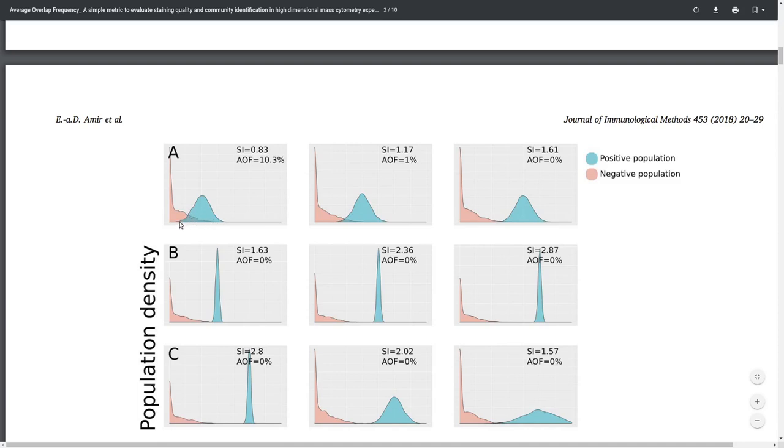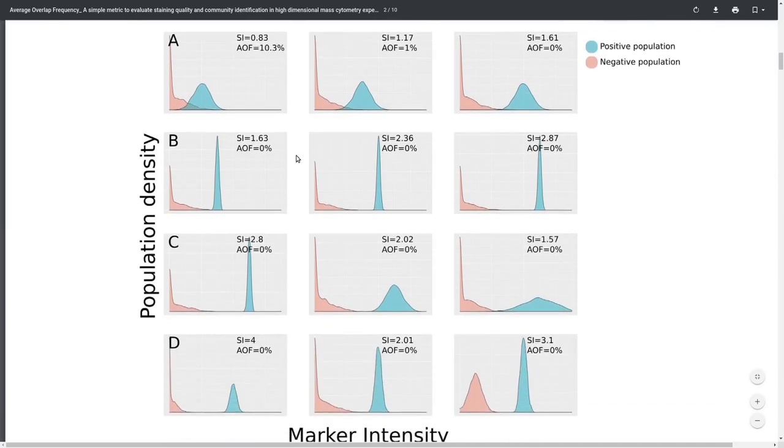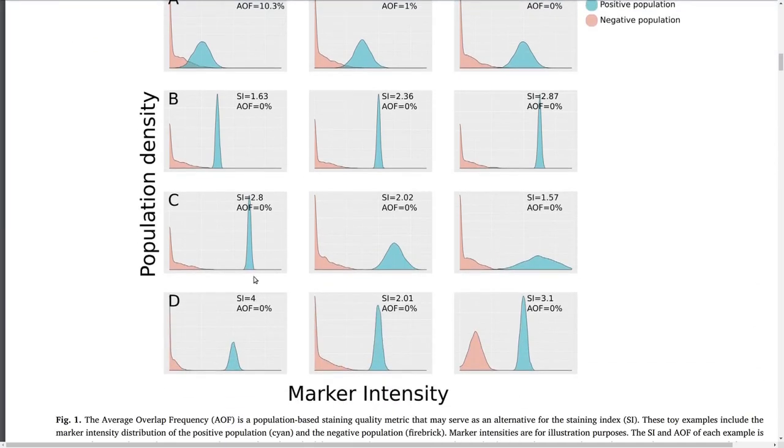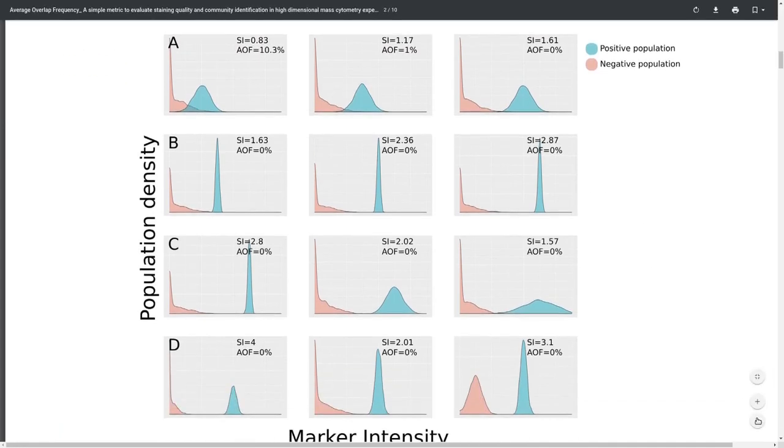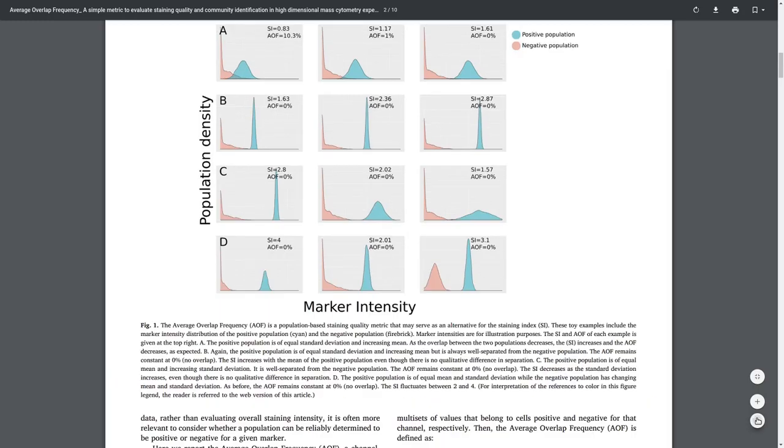The greater the shaded area, the higher the AOF. So an AOF of 0, as in these examples, shows a perfect separation between the positive and the negative peak, while as the AOF becomes higher, it shows that there might be a problem, and the two peaks, the two modalities might overlap.